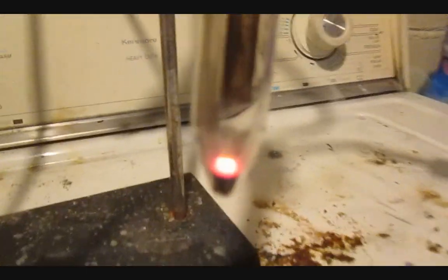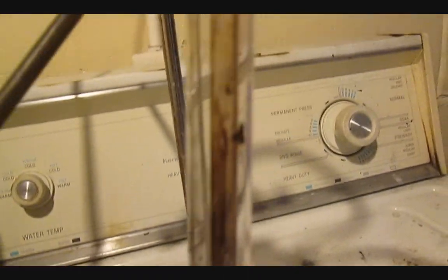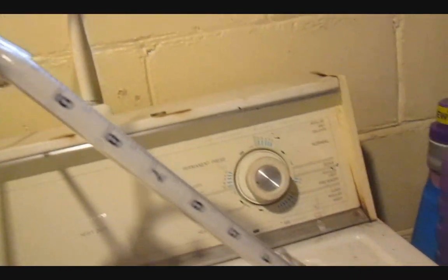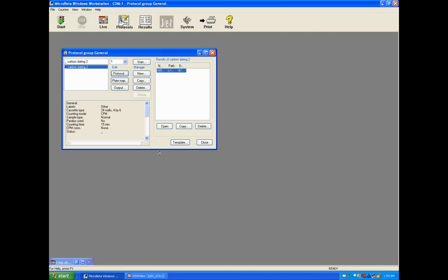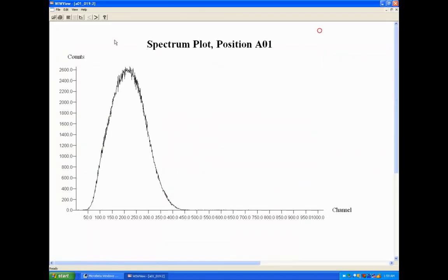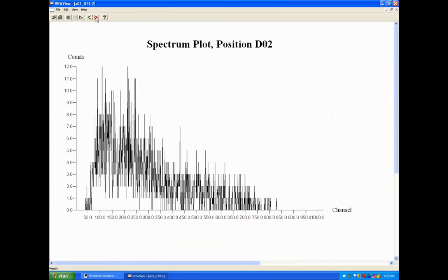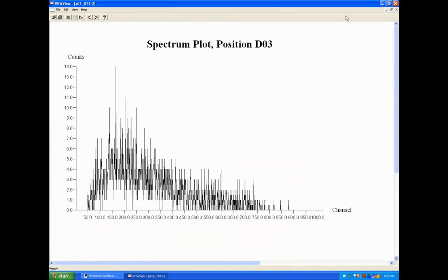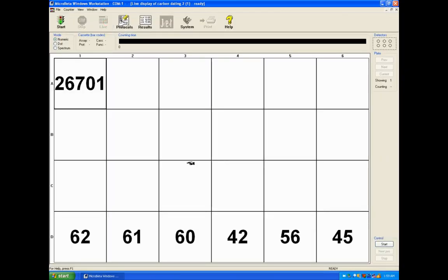The extraction and preparation went very well. I set up three blanks with the same matrix as the sample for an even and equal measurement. The samples have to stay in the dark for a few hours to allow static and possible radon to dissipate. And my results are as followed.